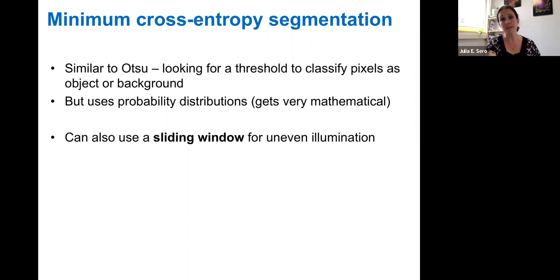These are good tricks of the trade for working with microscopy images, but these are also the same processes that are used in photography and in cinema to identify Spider-Man against a background, and then say, oh, let's take Spider-Man, and oh, he's in New York, and now let's put Spider-Man in outer space.